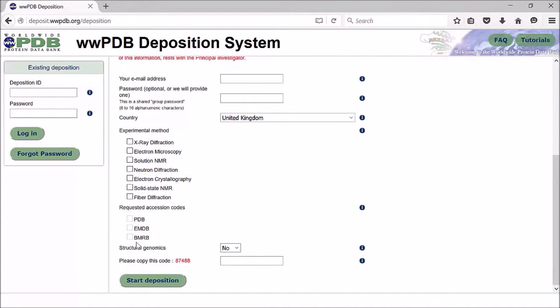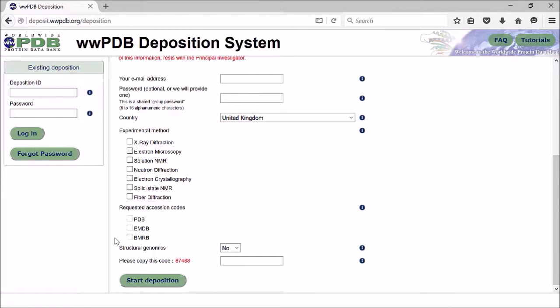However, for an EM entry, you may also want to do your map submission in one deposition, so you can also select to request an Electron Microscopy Data Bank accession code as well. There is also a BMRB link there if you are depositing NMR data.